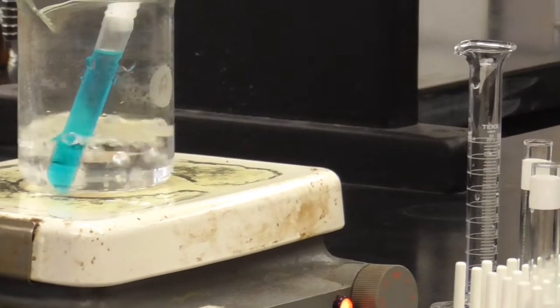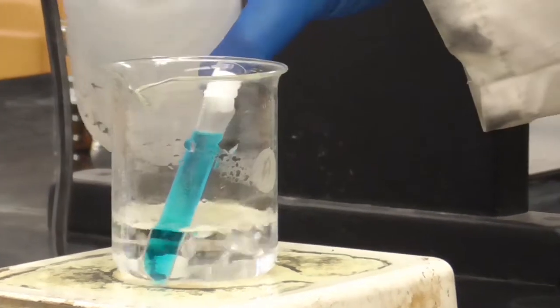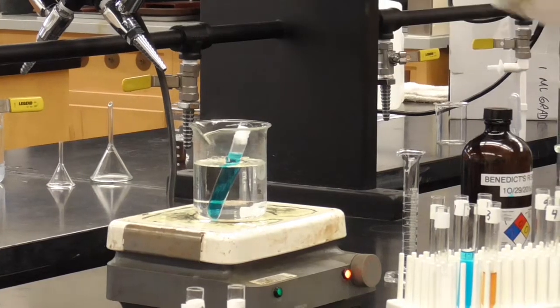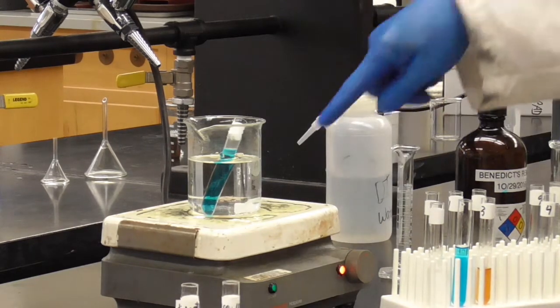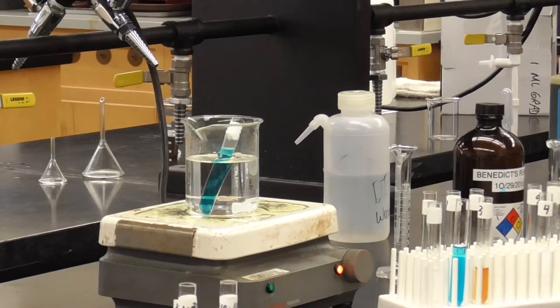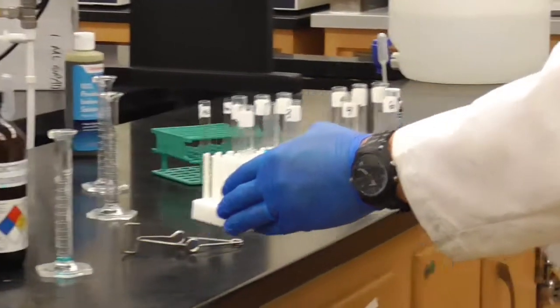I'm going to go ahead and add a little bit of water in here so we heat the whole test tube. And so that'll take a little longer for it to heat up. So we'll make sure to give it at least 5 minutes, maybe even a little longer, to see if we get that positive test developed. And we'll give it at least three minutes after it starts to boil again. While we're waiting for that, let's go ahead and do our starch test.